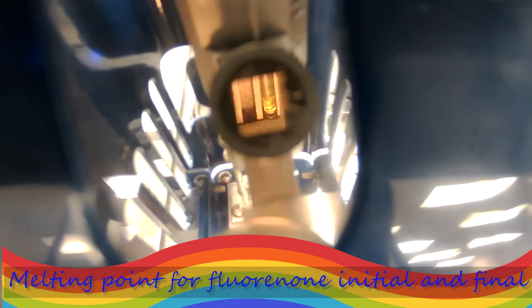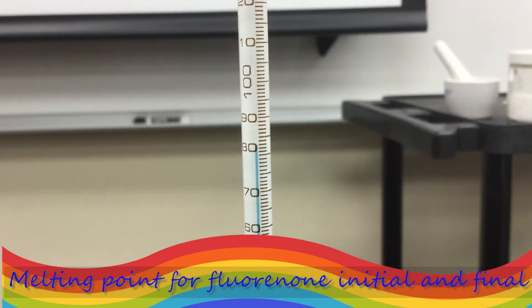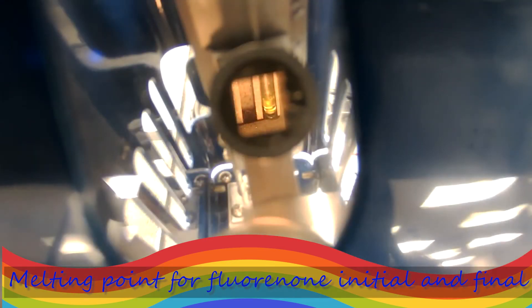Okay, initial melting took place. And as soon as it turns clear, all solid changes to liquid, we are going to record the final. See, what is happening now. Very nice. Okay, everything is liquefied and we have the temperature of 82. So it started at 80 and it finished at 82. And at this point, we turn off the meltdown apparatus. Let it cool down before we use the next sample.